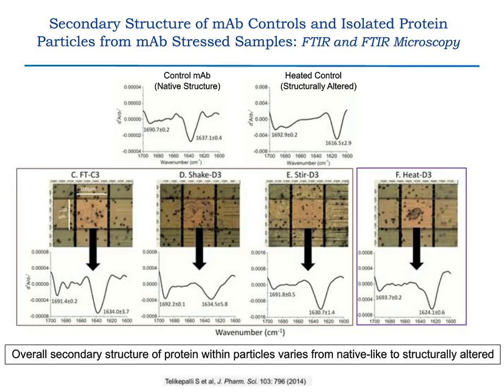or aggregates. We then on the bottom look at the isolated particles from the stress samples, and we compare them to our controls, and we can see that the overall structure of the protein within the particles varies from native-like to structurally altered depending on the stress.